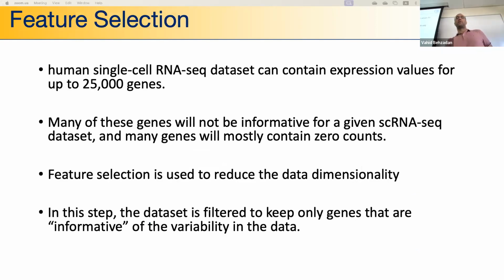So for feature selection, we mean that we want genes that vary between the conditions, right? We don't want genes that have the same values over all cells.